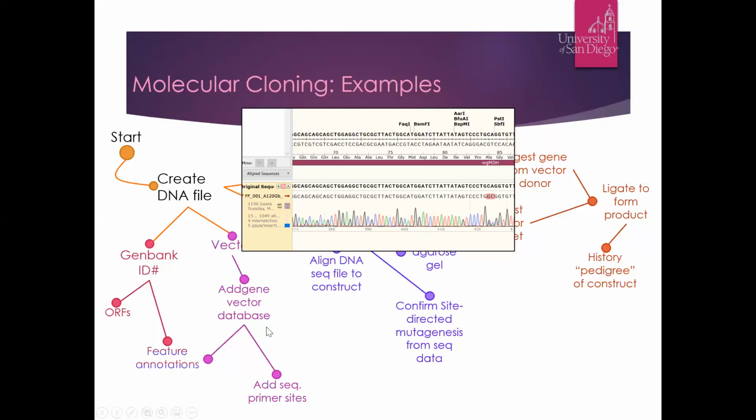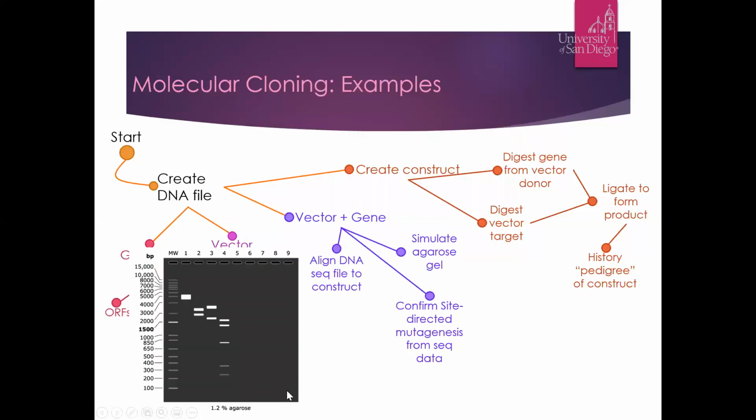Here's an example of running a simulated agarose gel. So a restriction enzyme digest of 3 singles. So the first one, lanes 1 through 3 are single digests, and we have the triple digest in the 4th. So in class, I might do a restriction fragment puzzle where I give them a table of data and ask them to reconstruct a vector. And in this way, I could also simulate a gel and show them that, if that's part of kind of explorations that you do in your class.